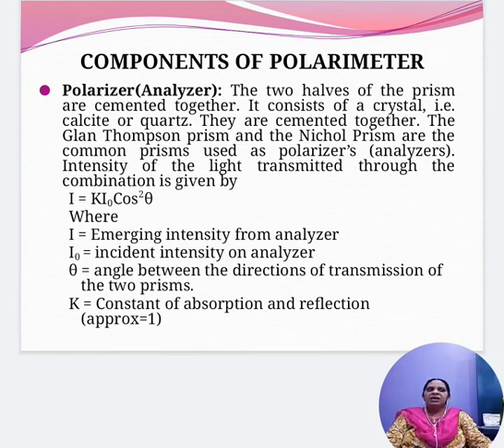So this is the intensity relationship of the light transmitted through the combination of the analyzer and the polarizer.